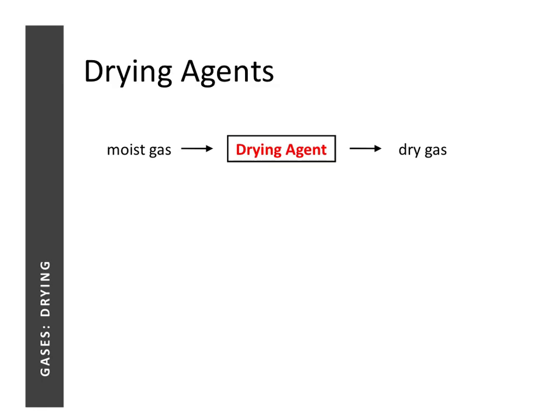Now earlier I mentioned that in chemistry many reactions produce gases, and very often we need to collect them in order to analyze and identify them. But there's actually a step that's very essential prior to collection in order for us to make a correct analysis. Why? Because when a gas is produced, it's often produced with another gas, and the other gas is actually water vapor. So in order to analyze the gas correctly, we need to first remove water vapor from the gas.